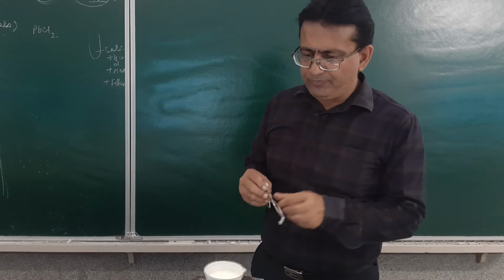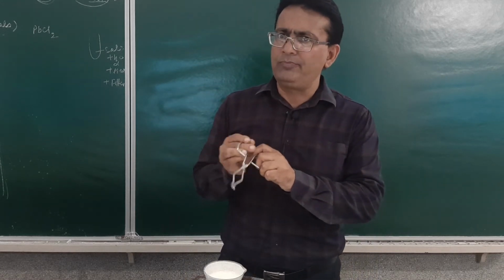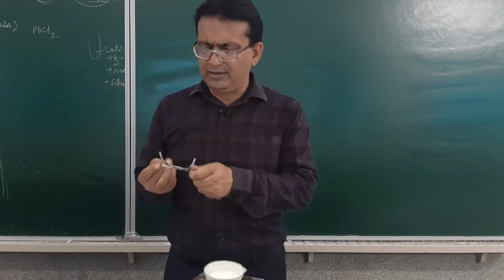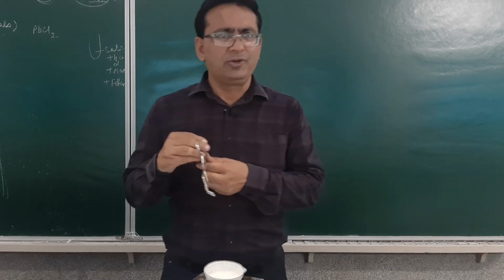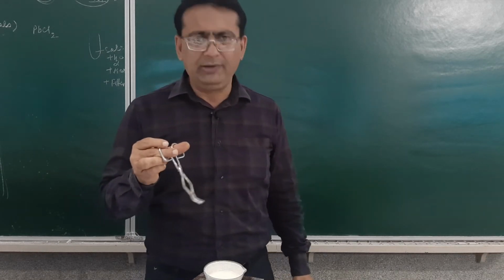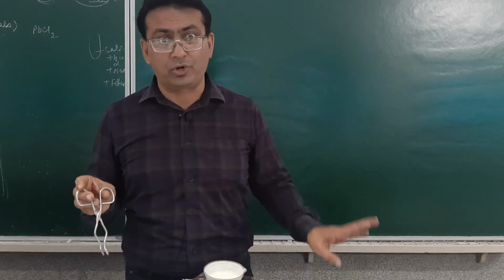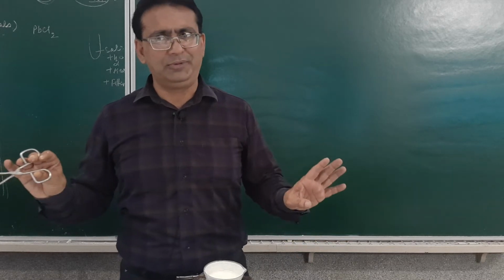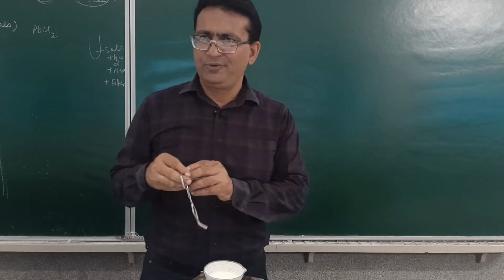Now what I will do, once I find it is heated up, I will pick this up with the help of a tong. You have to hold it very tightly so that it does not spill. If it spills on your hand or on a body part or on your clothes, immediately tell me. You will be 100% safe. There is no problem. Fine?